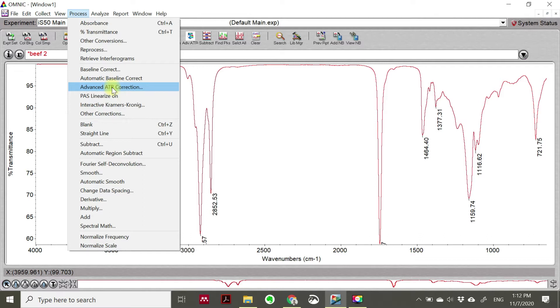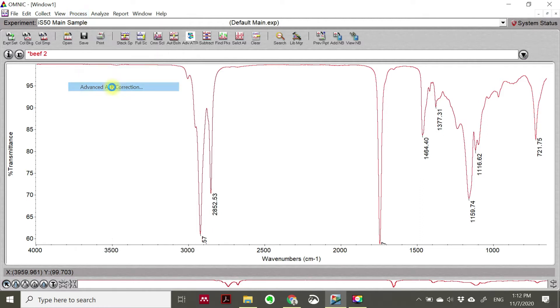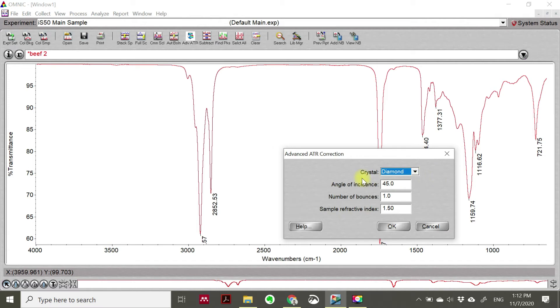The ATR-produced result should be corrected to become a transmission data file. So we have to do this Advanced ATR Correction here. The crystal that we use in the analysis is diamond - that depends on your FTIR that you have in your laboratory. Sometimes when you first purchase, maybe you use germanium, maybe you use zinc selenide.